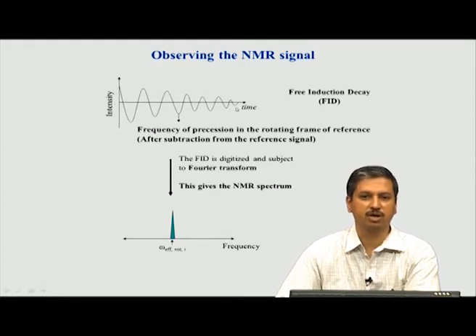but from a mathematical perspective, one does not have to worry about the discretization. We can think of it as a continuous wave. Now, if I do a mathematical technique called Fourier transform, it will give me the frequency of this peak. Fourier transform is something we will not be able to go into in detail in this course, but it is recommended that you refer to the books. Many NMR textbooks have a very basic introduction to Fourier transform, and they also give different ways to do Fourier transformation and what the effect is and so on.